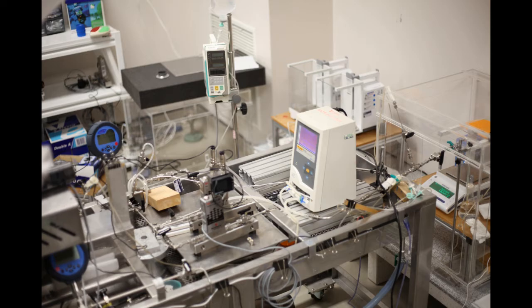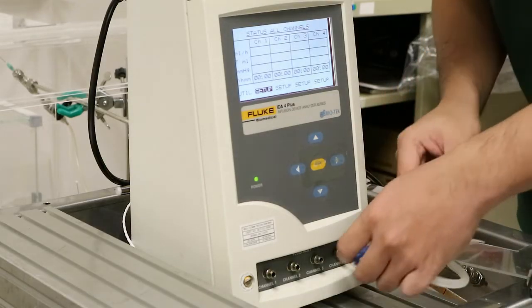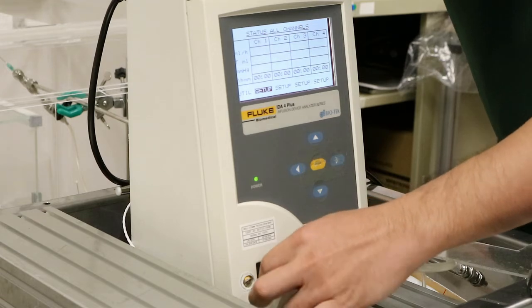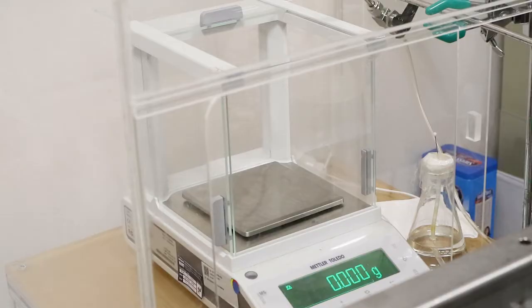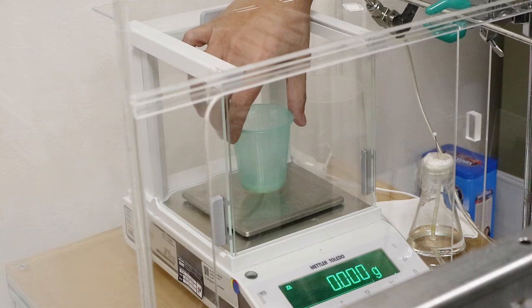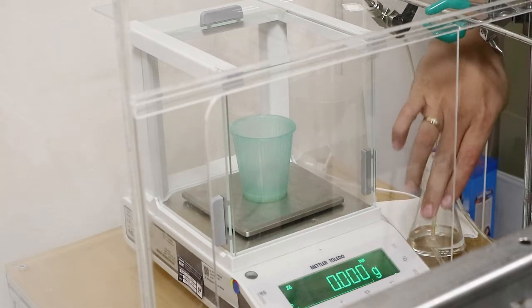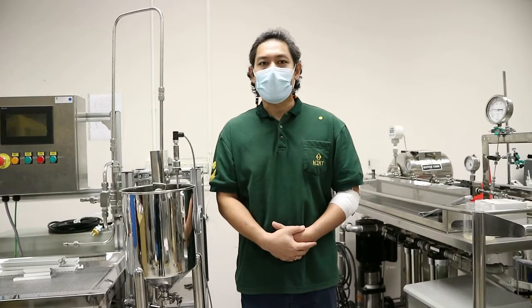The weighing method is selected as the main equipment for the facility and is also equipped with a timing acquisition system. NIMT has 3 weighing balances, with 0.01 mg, 0.1 mg, and 1 mg resolution. The shield that covers the balance is used for controlling humidity and disturbance that would affect the balance performance. The pressurized and degassed RO water, DI water is also recommended, is used as the medium in the measurement.